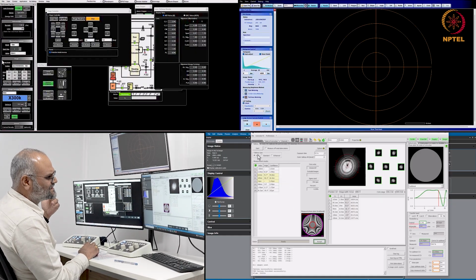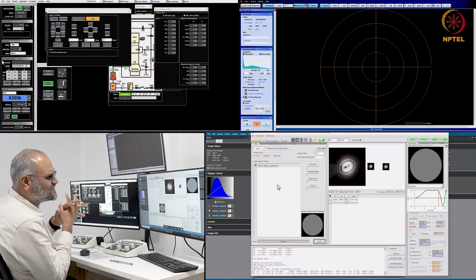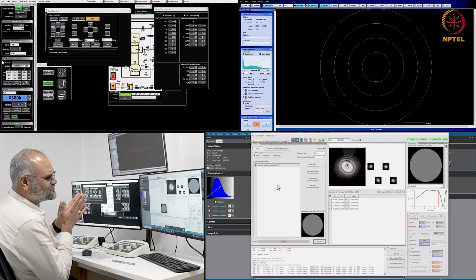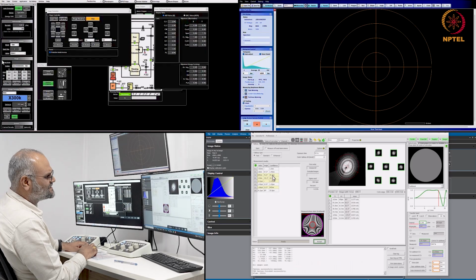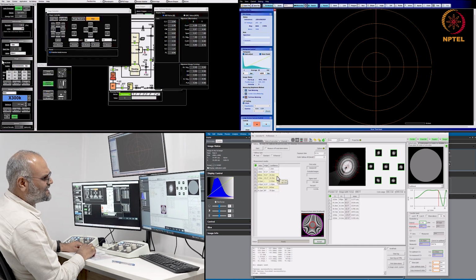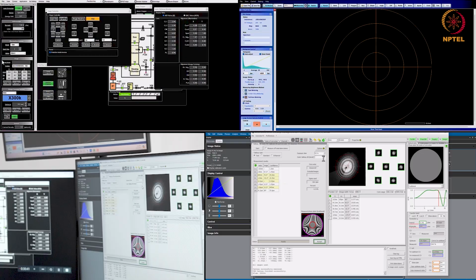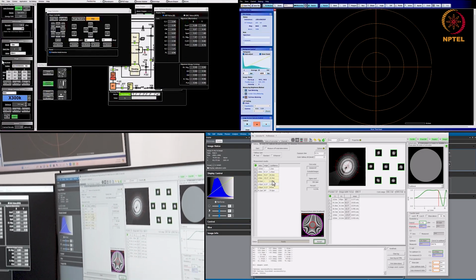So it doesn't harm to run the same thing a couple of times to ensure that what you've actually gotten is more or less accurate before you start accepting the values. So we see that both times the A2, B2 and C3 and S3 have some kind of error.